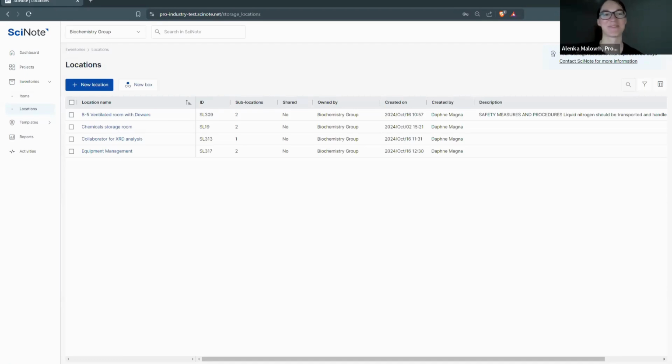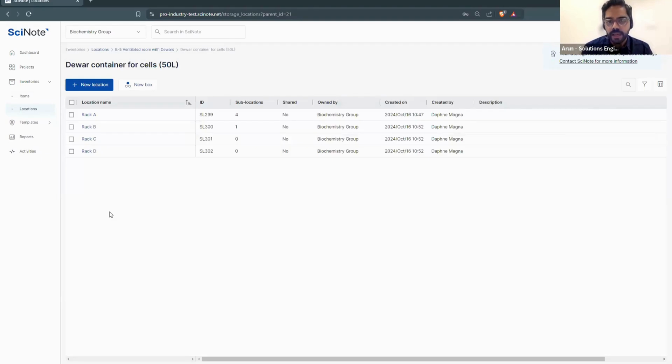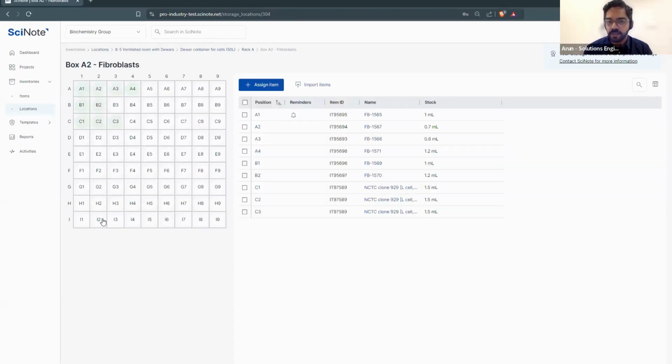Great, okay. And then the next question we have is, great presentation. Thank you, Pamela. When adding items to a box, when we are importing our inventory as an Excel file, my understanding is that we add the position of the box grid for each item. If so, how does it work for replicate vials? For example, if we have 40 vials of the same construct, do we add the item 40 times to be able to assign them to the box grid? Is there a way we can assign items to a range, such as A1 through D10, or does it have to be done individually?